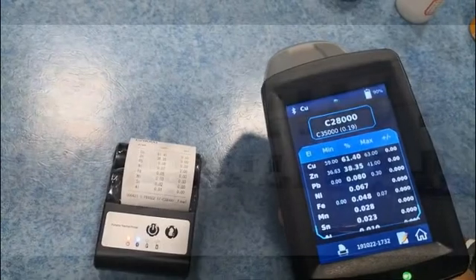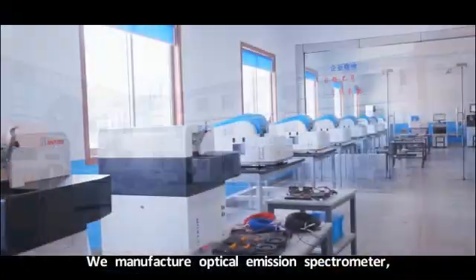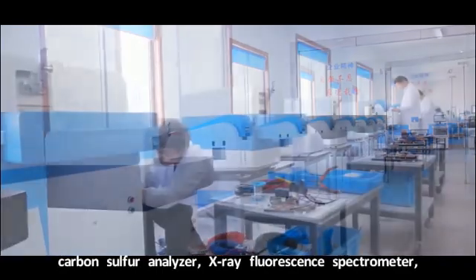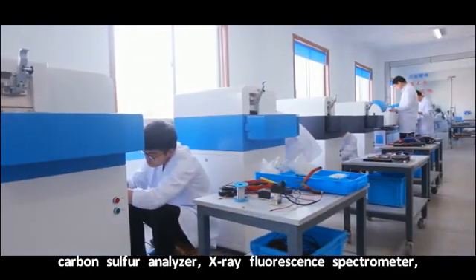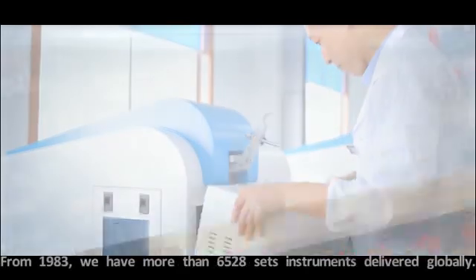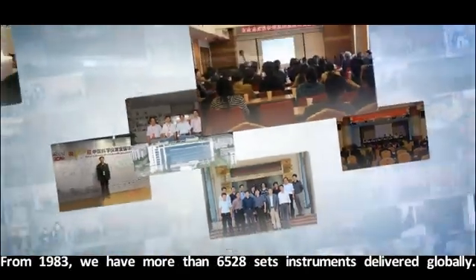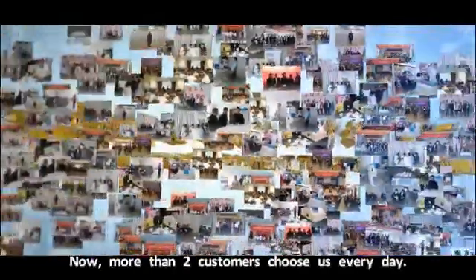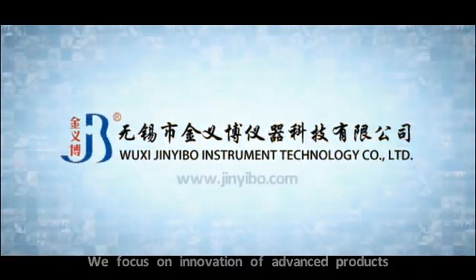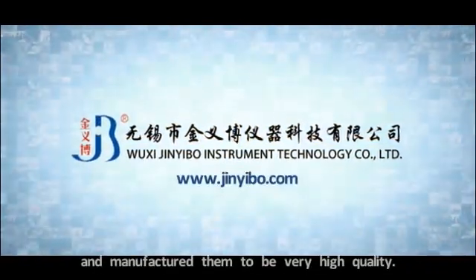This is our LIBS. We manufacture optical emission spectrometers, carbon sulfur analyzers, X-ray fluorescence spectrometers, ICP LIBS, and so on. From 1983 we have more than 6,000 sets of instruments delivered globally. Now more than two customers choose us every day. We focus on innovation of advanced products and manufacture them to very high standards.